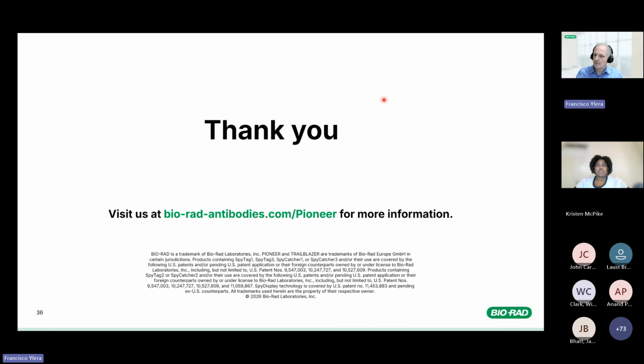What we did is for the light chain and for the heavy chain separately, we had a selection step to remove genes with a frame shift, so that only antibodies that are cloned without any frame shifts and insertions or deletions are selected and end up in the final library, a beta-lactamase selection step. And we saw during the QC of the library that it actually worked very well.